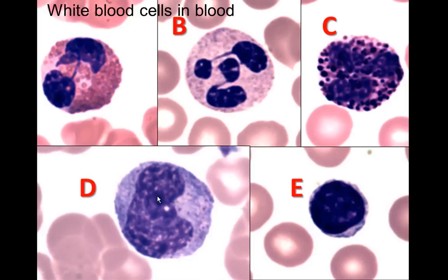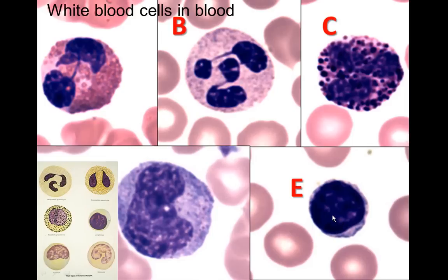The monocyte has a mostly euchromatic nucleus with a lot of cytoplasm. The lymphocyte looks mostly spherical at the light microscopic level with a small rim of cytoplasm around it. In comparison to our drawing, these are neutrophils, eosinophils, basophils, lymphocytes, and monocytes.